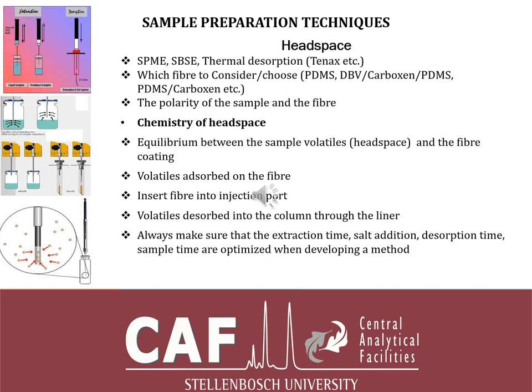Thermal desorption. If you've got a thermal desorption unit, you can also use a stir bar in there. So when your compounds of interest are attracted onto the stir bar, you can just put it in a thermal desorption unit, run it, and flush that within your carrier gas, and then you get your compounds onto the column.